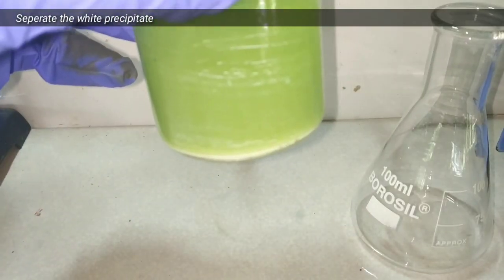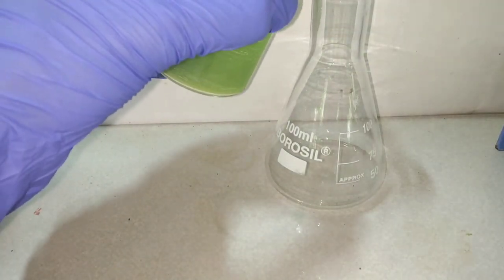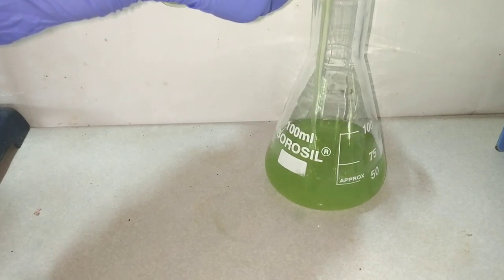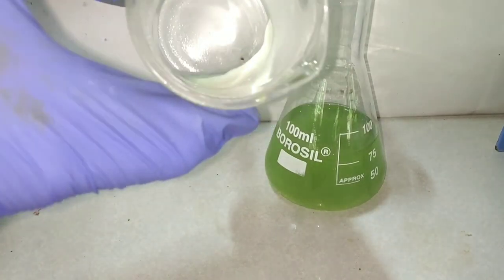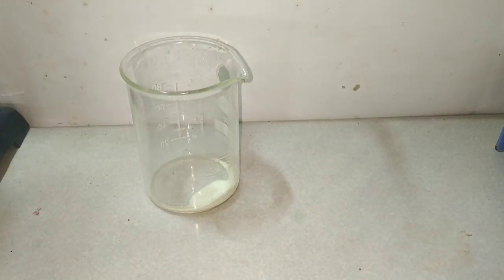Now we decant off the supernatant solution and collect the precipitated copper 1 chloride. It is very easy to decant off the supernatant solution as the copper 1 chloride is very dense and has completely settled at the bottom of the beaker. Here you can see the white precipitate of copper 1 chloride.